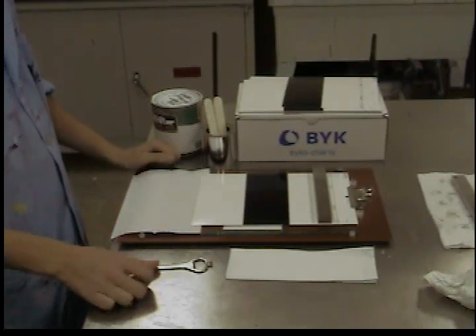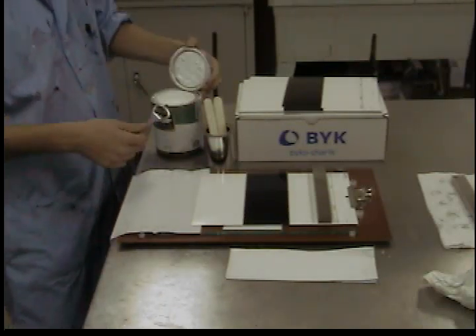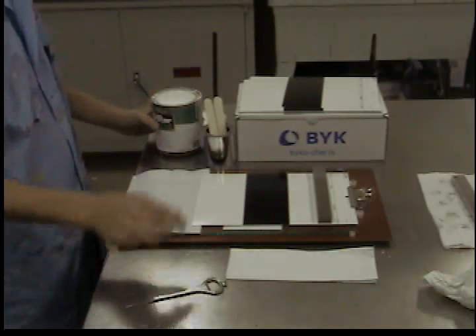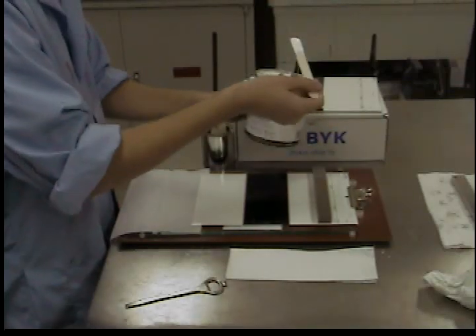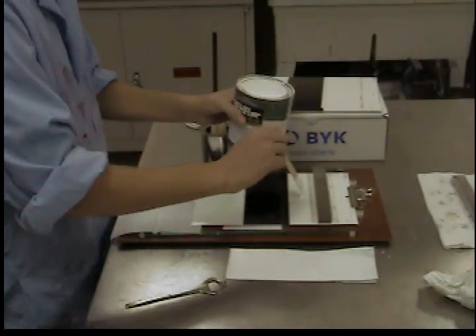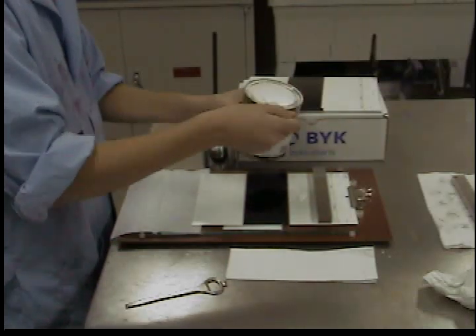Next, apply a puddle of paint to the Bicco chart in front of the bar type applicator. Repeat this process until the puddle is about 2 inches in diameter.